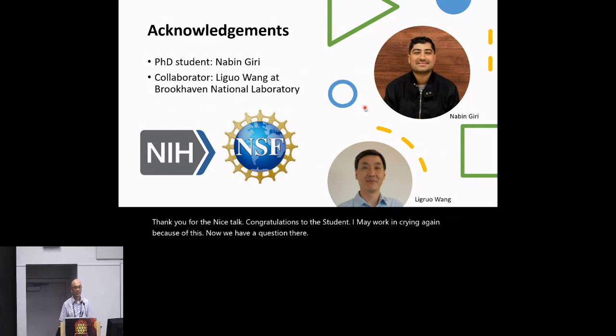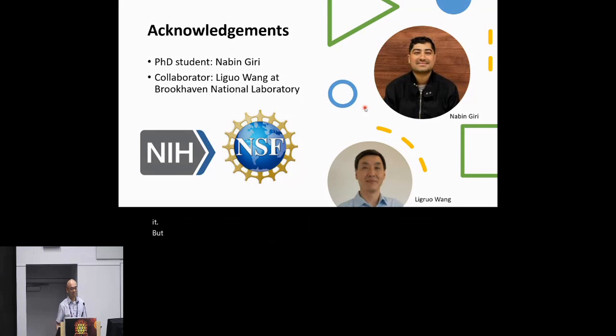Very interesting. I've seen recent Cryo-EM work going in the direction of trying to take snapshots of the entire cell. And then obviously what we will need is methods that combine threading, to guess from the shape the protein composition of the complex before you can even model it. But combining the two things. So if you could expand a little bit on how far you are from being able to do that.